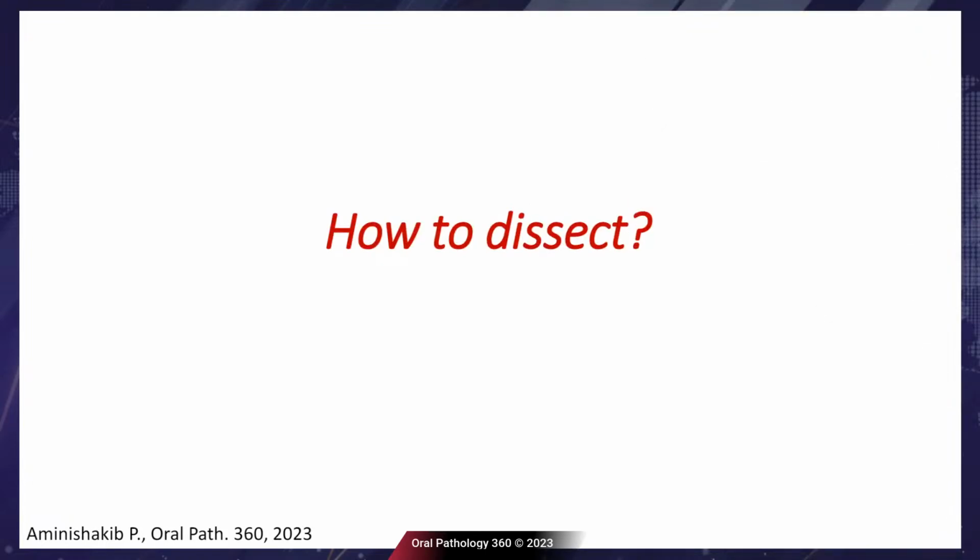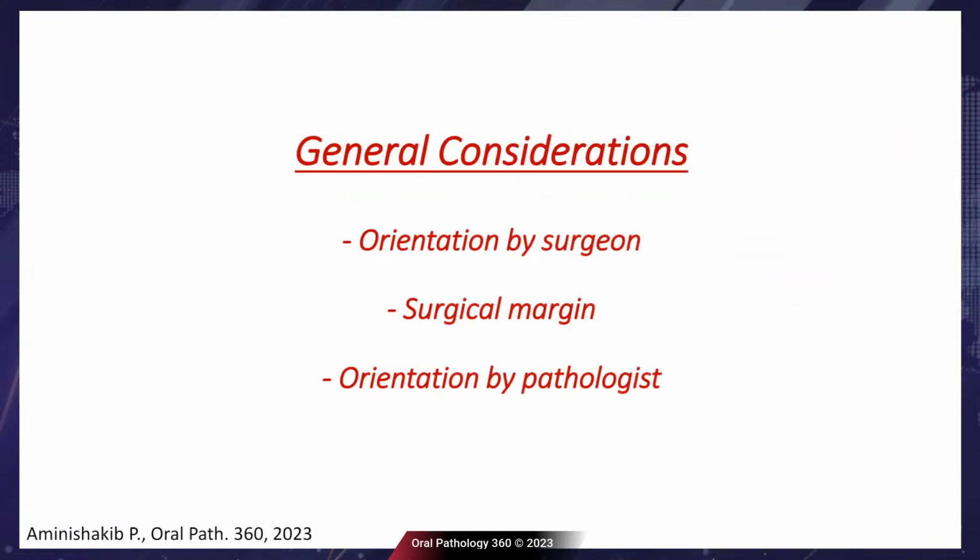Okay, let's get started with the general principles of dissection of a specimen, especially oral squamous cell carcinoma or head and neck cancers. Let me share some details about general considerations, especially orientation of the specimen by surgeons and the importance of surgical margin in cancer cases, and orientation of the specimen by pathologists.